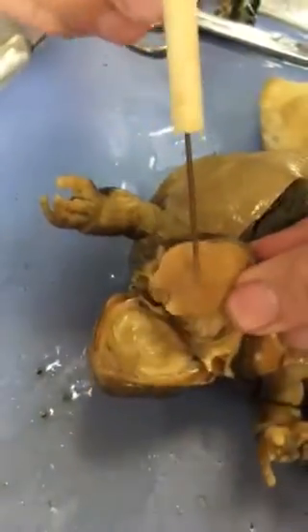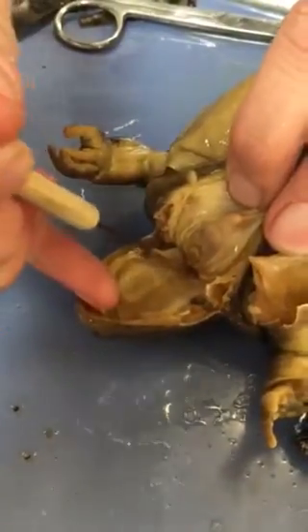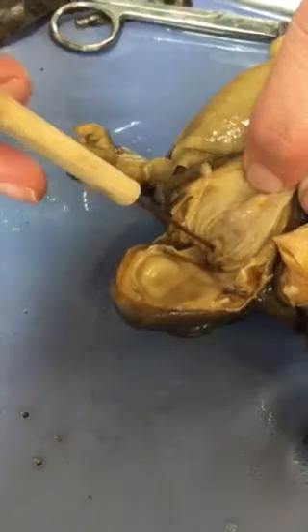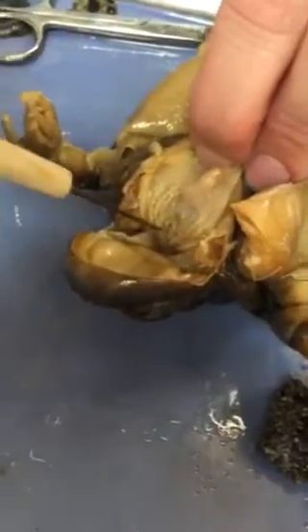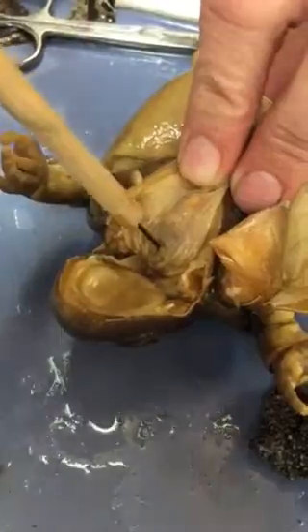And so this is the tongue. And then you have these openings right here. These are the eustachian tubes. And then you have this opening right here that basically air goes through. And so this is the glottis. There is an esophagus back here, or pharynx actually, that you don't need to know. So if I have a pin here, I'm looking for the glottis.